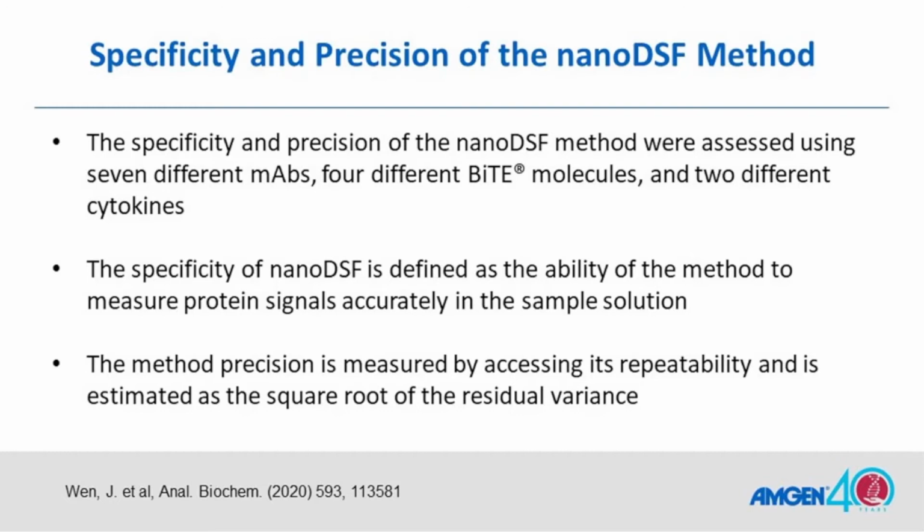The specificity of nanoDSF is defined as the ability of the method to measure protein signals accurately in the sample solution compared to the buffer.